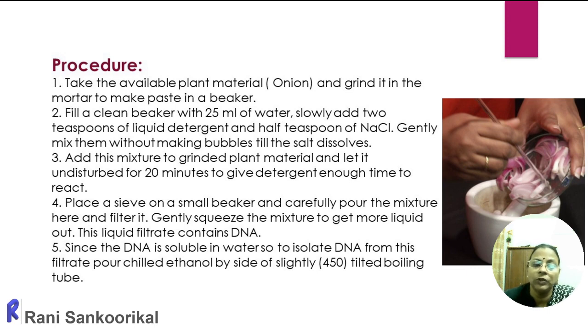Then take a beaker with 25 ml of water, and slowly add 2 spoons of liquid detergent. To that you can add half a spoon of sodium chloride, and gently stir it. If you stir it very fast, the froth and bubbles will come out, and that will interfere with the separation or precipitation of the DNA. So slowly stir it and make it into a solution.